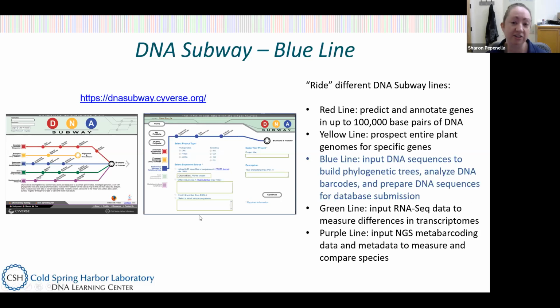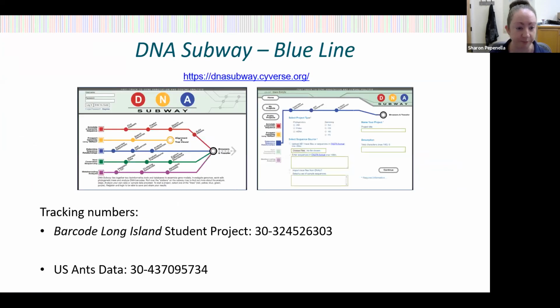So if you would like to follow along, I'm going to give us some information in just a little bit on some example sequence data that everyone can use. But you can go ahead to the website dnasubway.cyverse.org. And Allison, I'll ask you to put that in the chat if you wouldn't mind. So, dnasubway.cyverse.org, and you can follow along with the sequence data that I'm going to be processing now.